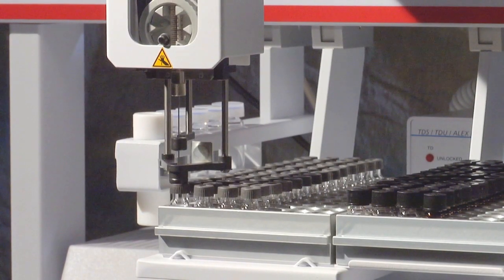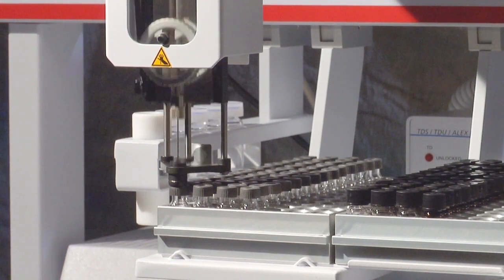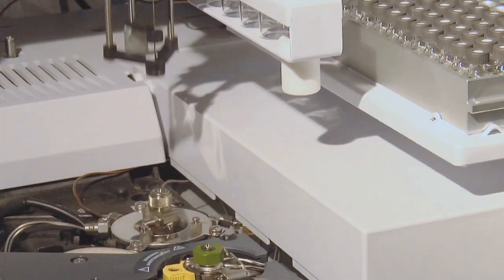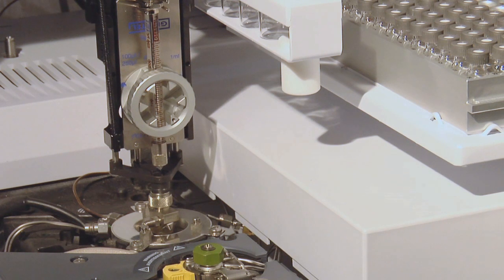For large volume injections, the MPS slowly injects sample into the Gerstil Cooled Injection System, or CIS. Solvent is eliminated and the CIS is then rapidly heated and the analytes are transferred onto the GC column, thereby concentrating the sample for increased detection limits.